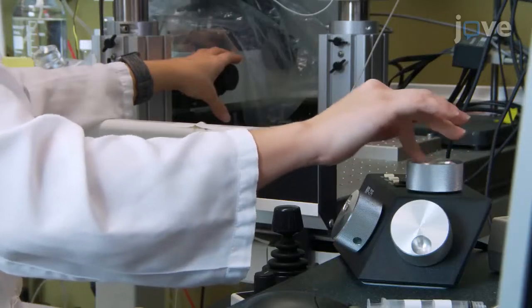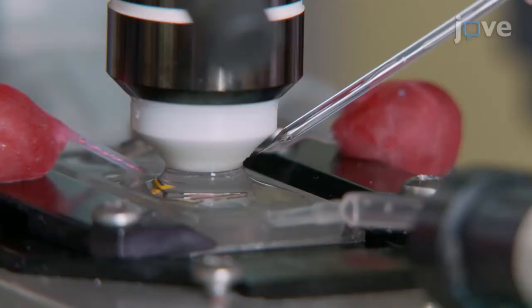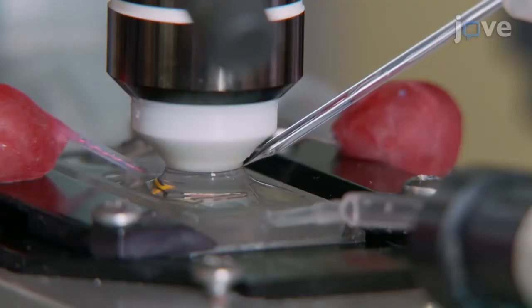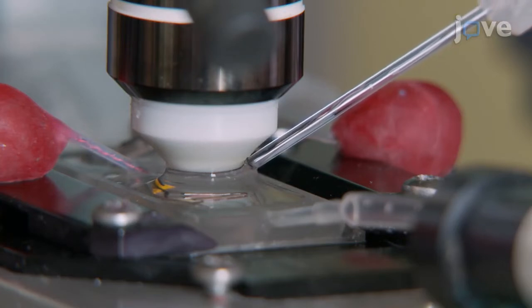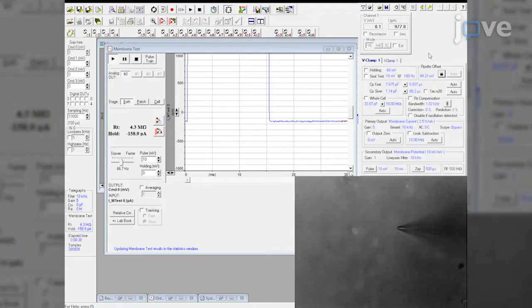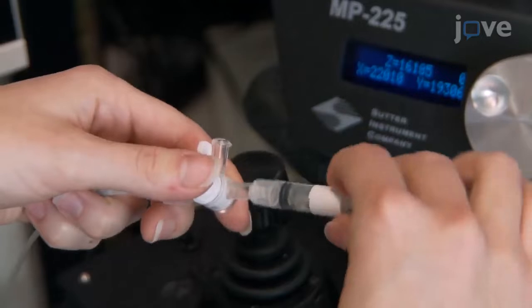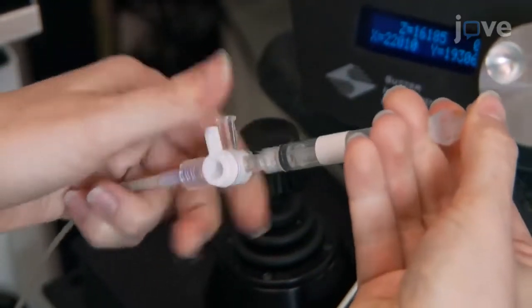To obtain whole-cell configuration, place the recording pipette just above the slice and offset pipette current in the voltage clamp mode. Apply slight positive pressure to the pipette and lock the stopcock.